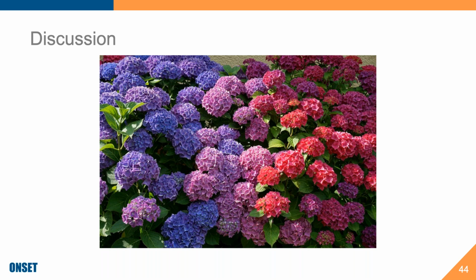Someone asked, is storage solution the same as pH 4 buffer? The answer is no, it's not. But there is a hierarchy that we would recommend in terms of storage solutions in general. So storage solution is a salty, somewhat acidic solution that inhibits bacterial growth and maintains the equilibrium between the salts in both the reference, I'm sorry, the electrolytes and the solution.